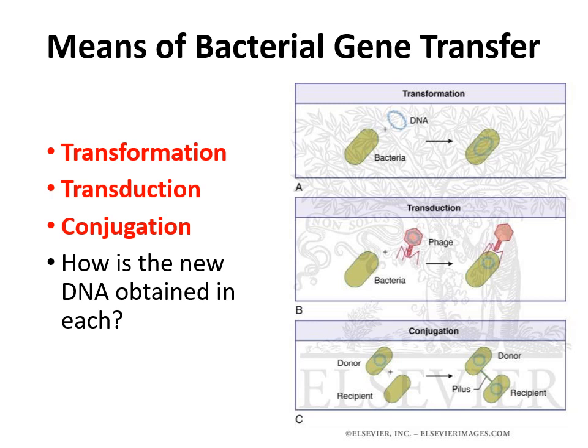And then you have regular old naked DNA, meaning just strands of DNA around that cell, not in any kind of structure or cell, just free-floating DNA, and you get the bacteria to take that DNA in.